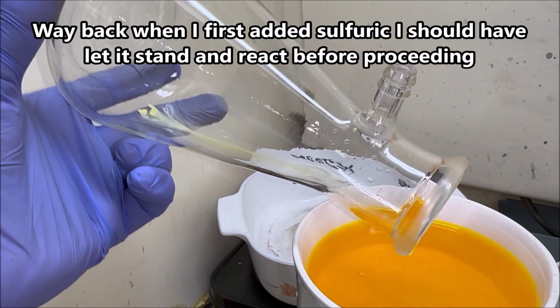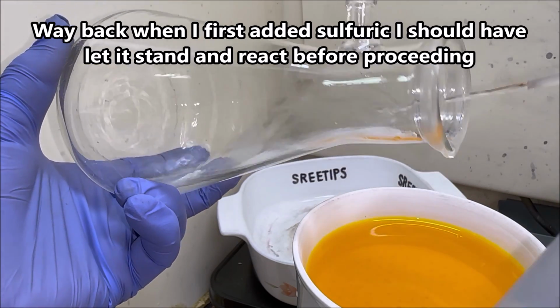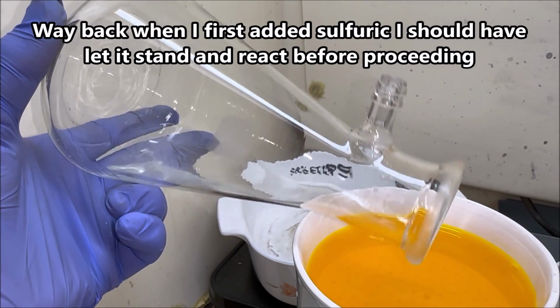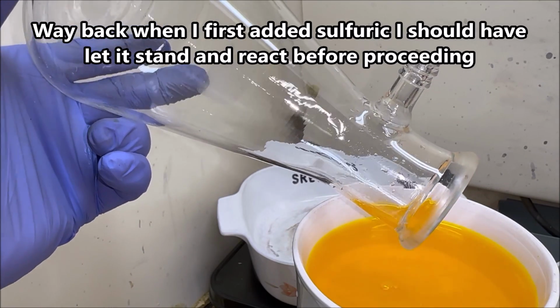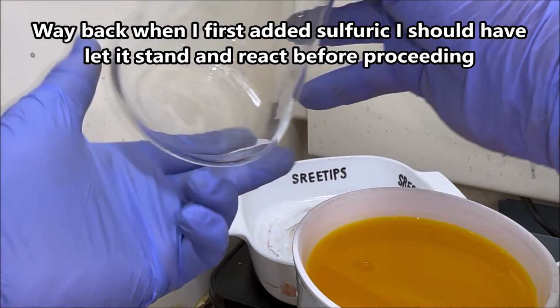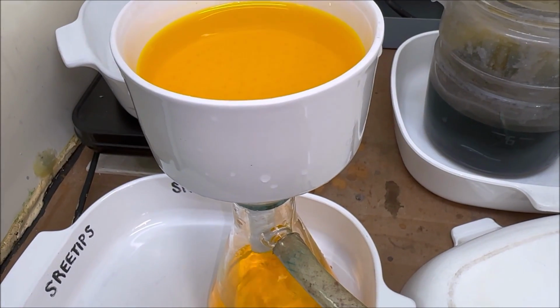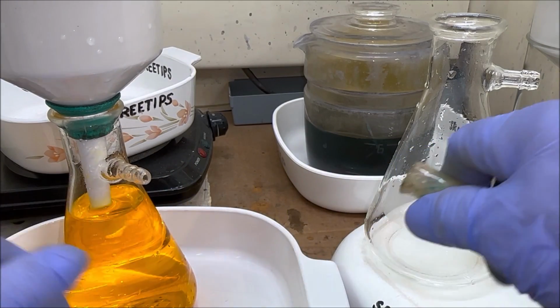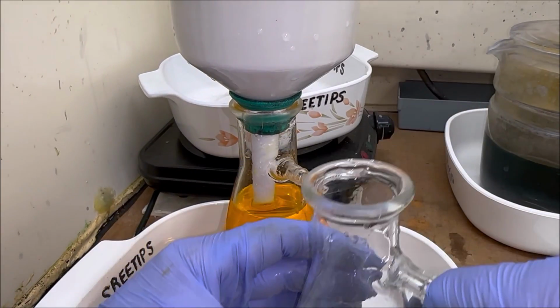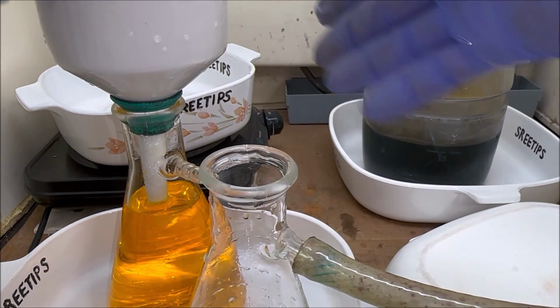I don't think it went through the filter. I think it probably was still reacting as we poured it through the filter, and then after it pulled through the filter and got down into our flask, it precipitated out because of the sulfuric that was present during that filtration. An emergency situation here. Gonna have to change flask because we got too full.